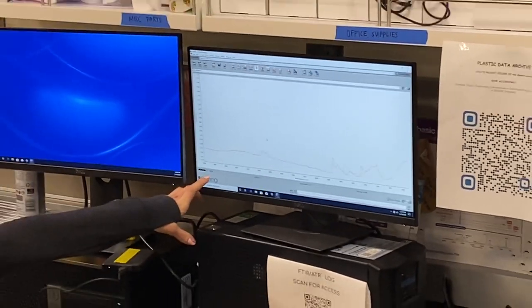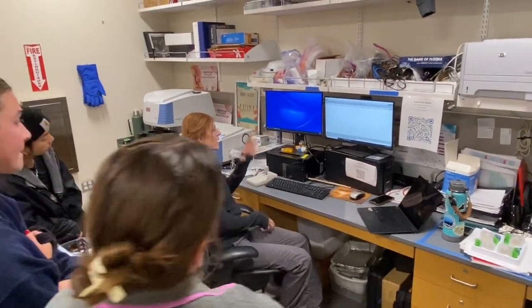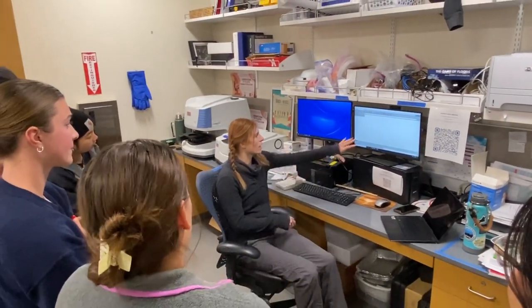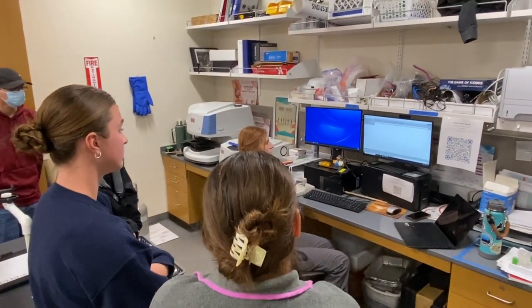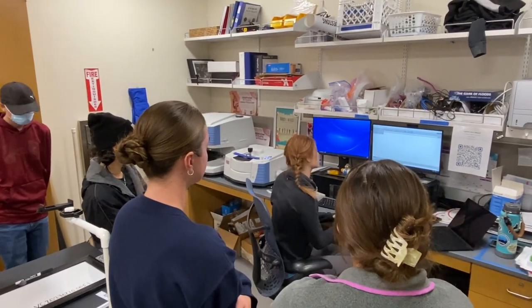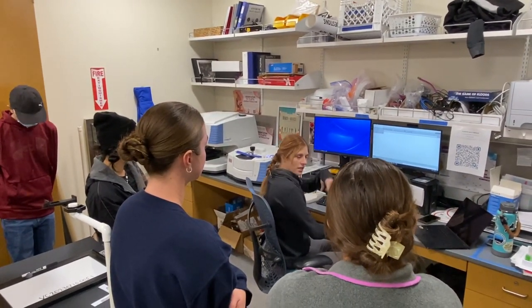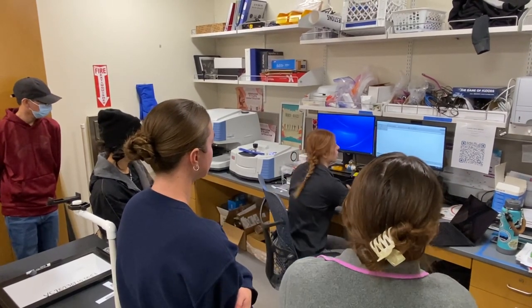Because what it's doing — so these numbers that it's running through: this 18 means it's taking 18 scans. When I'm setting this up, I can change it to as many as I want — I can say take 40 scans. That means it's going to be a little bit more accurate, because it's going to bounce that laser that many times, so it can narrow down that spectrum a lot better.